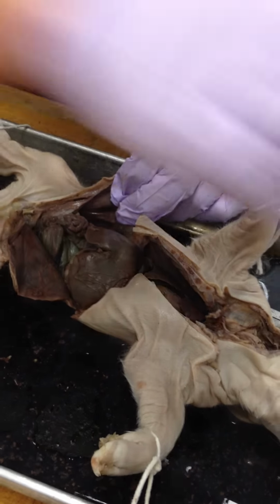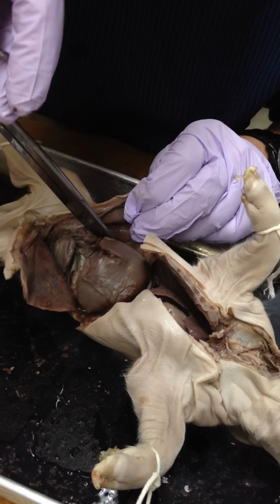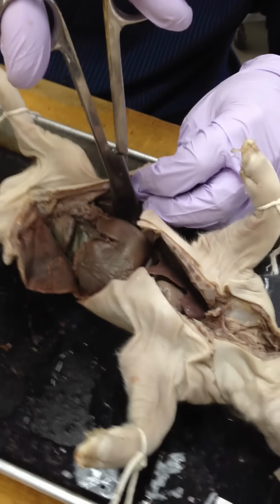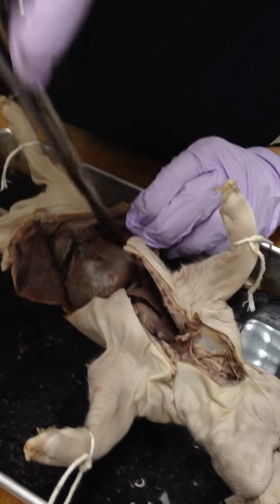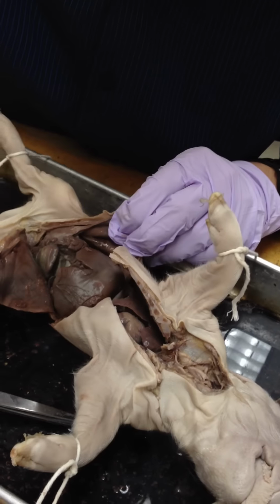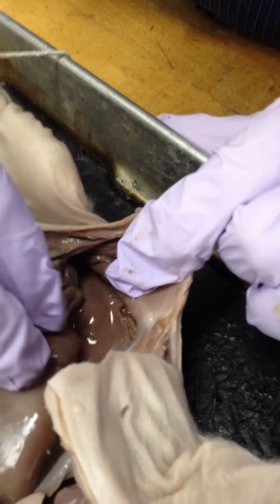Maybe it's just really super hard to notice. Hang on, I'm gonna get this out. I'm gonna open this a bit. Let all the goo out. There it goes. Come on, when you were young, you lived for that smell. No, I'm not young anymore, and I never lived for that smell, let me tell you. So here's one of the kidneys, by the way. Got it nice and exposed. Sweet. This guy right here, the big bean.